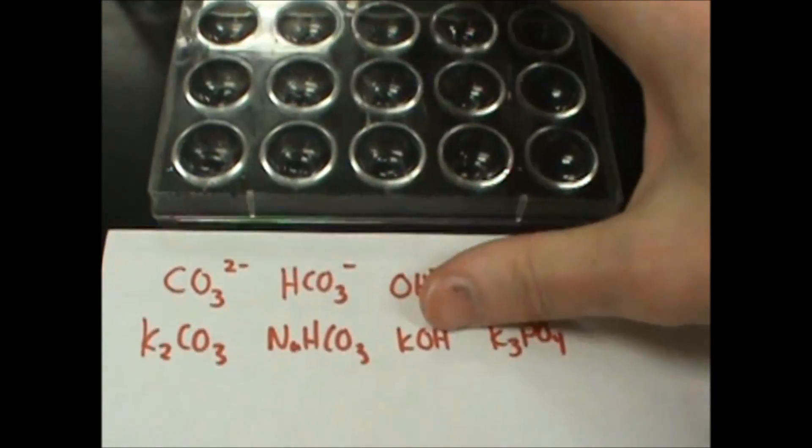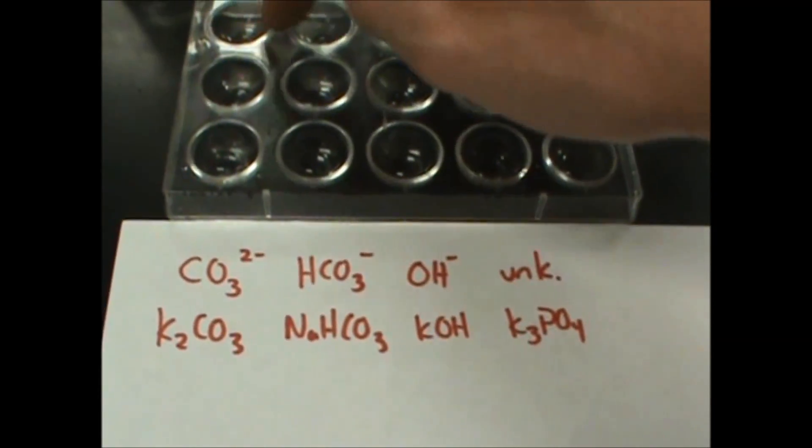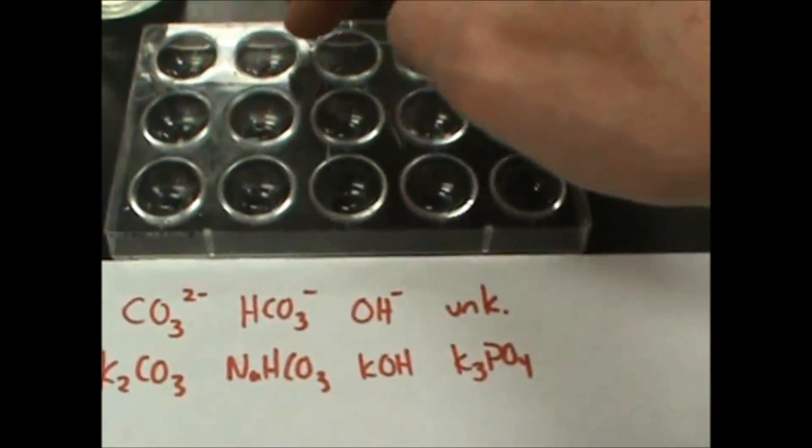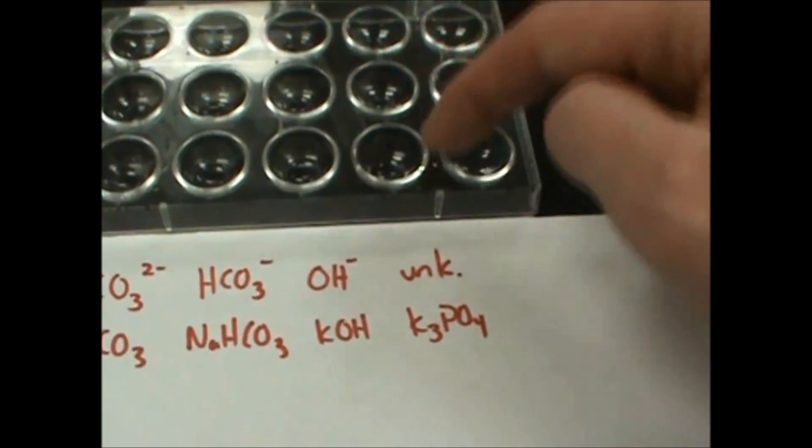Here I'm going to run you through how to do the carbonate, bicarbonate, and hydroxide tests. I've put carbonate into these three wells, bicarbonate into these three, and hydroxide into these three, and then I've put my unknown, which for me I use potassium phosphate.